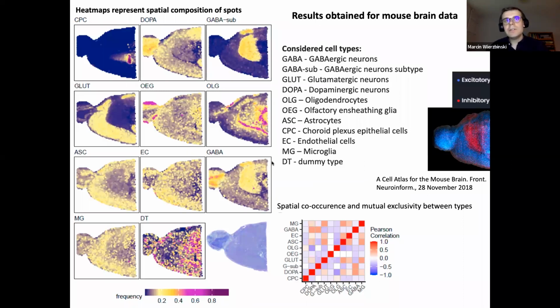Okay, and this result shows the Celloscope's capability to unravel spots' percentage composition with respect to the cell types, so that the decomposition is useful and it's quite okay.